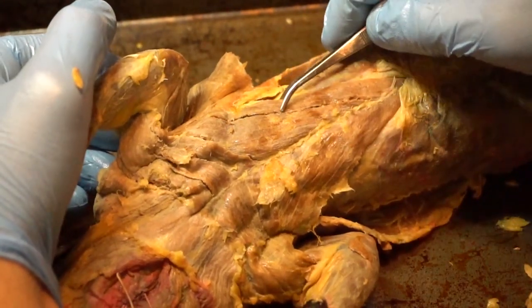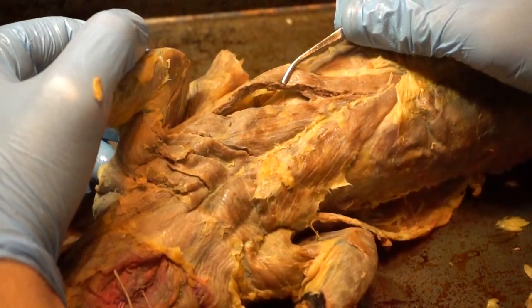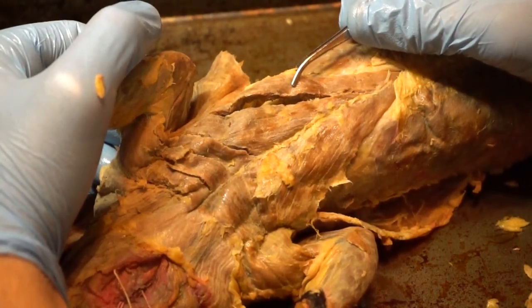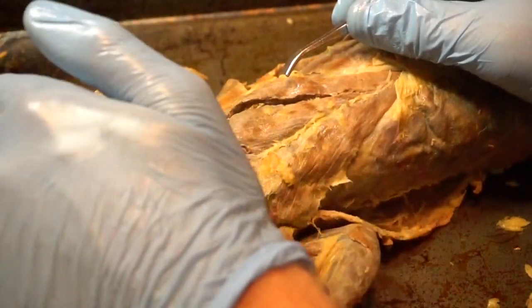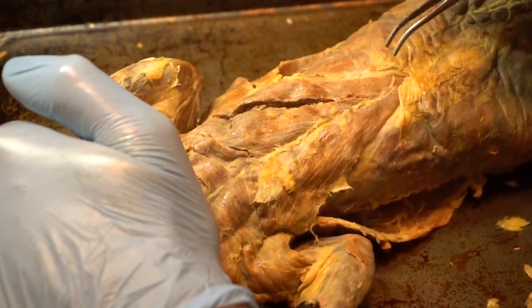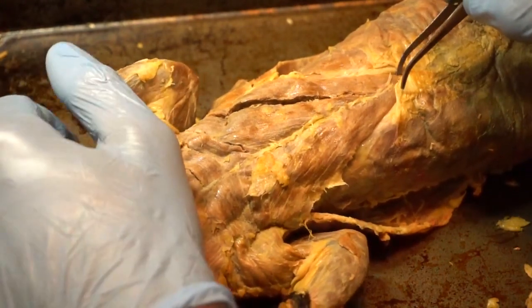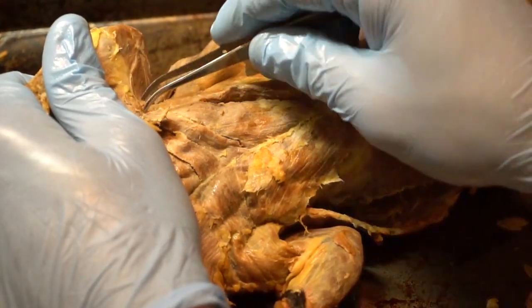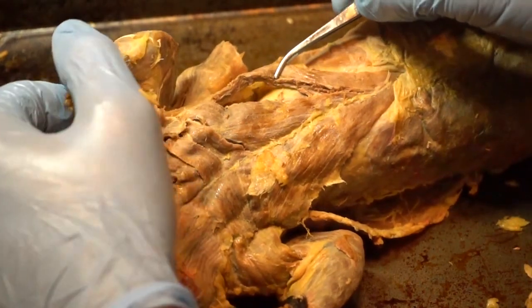Coming down here you have two muscles running the same direction. This first one is a muscle that mink and cat have that humans do not. This is called your xiphyhumeralis — everything you need to know is in the name. It starts at the xiphoid process of the sternum and goes all the way up to the humerus. So this is called your xiphyhumeralis.